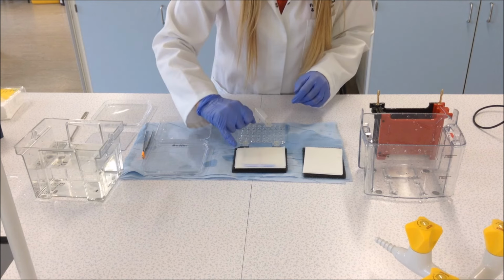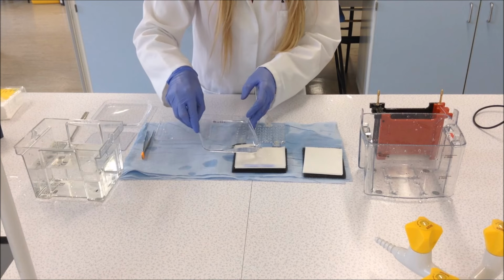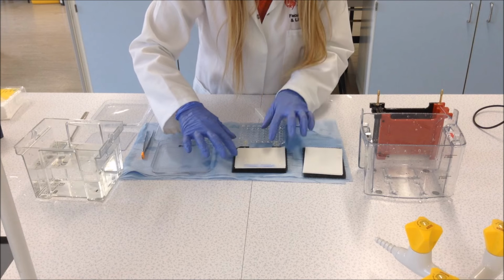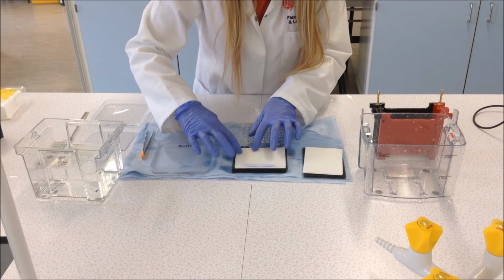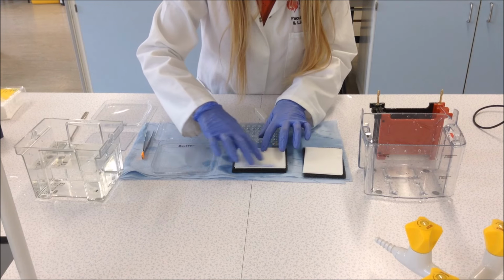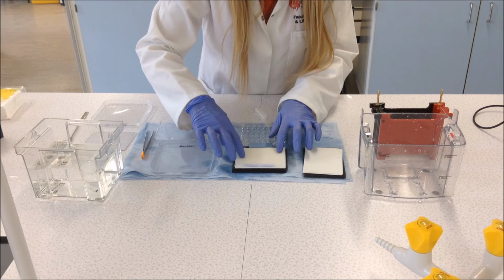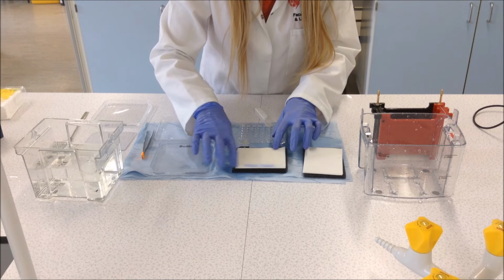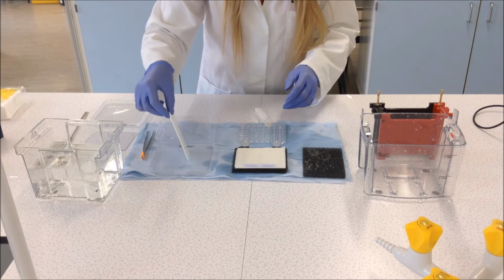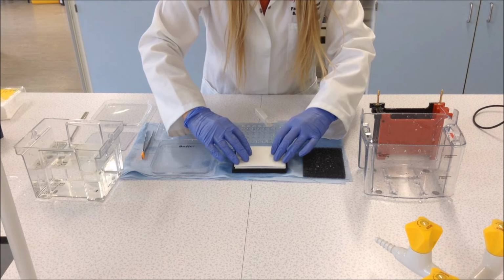What you may notice is that when you lay down the membrane, you might see some air bubbles forming. One of the best ways to remove these is to pour some transfer buffer over it, and then use either a roller or carefully pat away the air bubbles. With the air bubbles removed, you can then re-soak the blotting paper in some transfer buffer and carefully place that on top of the nitrocellulose membrane.